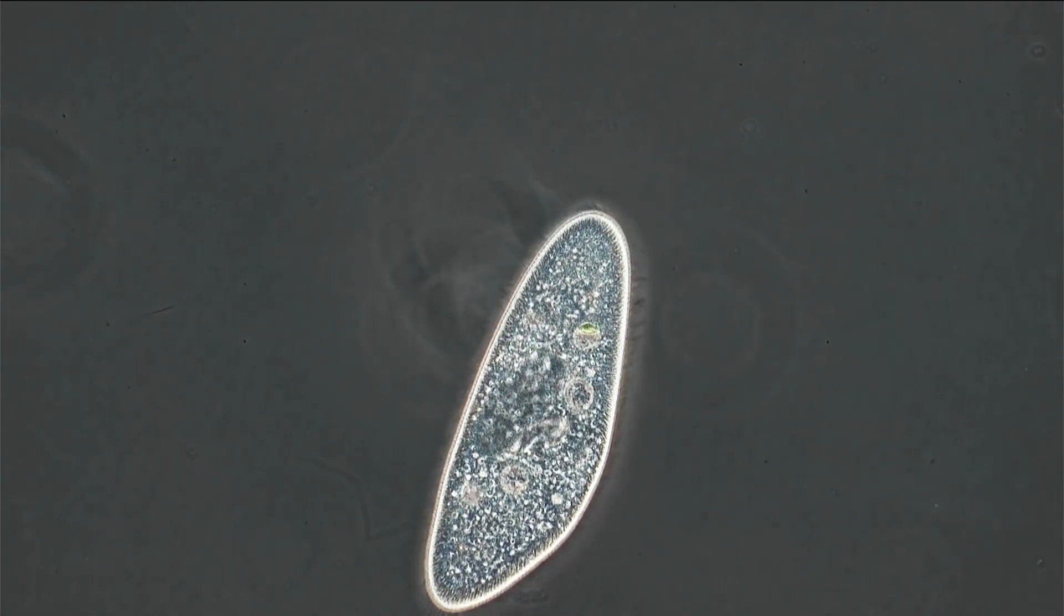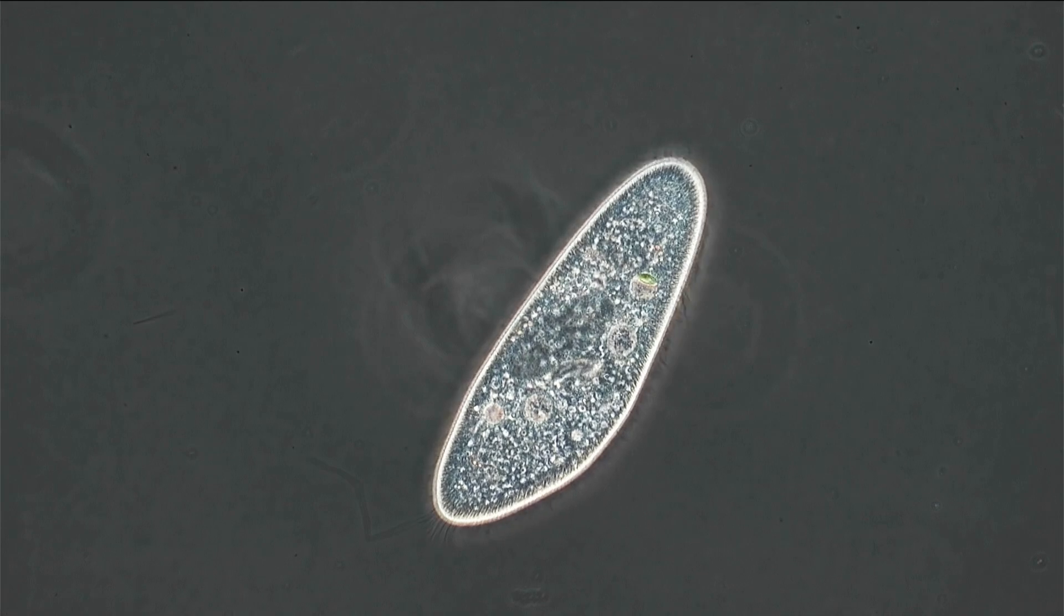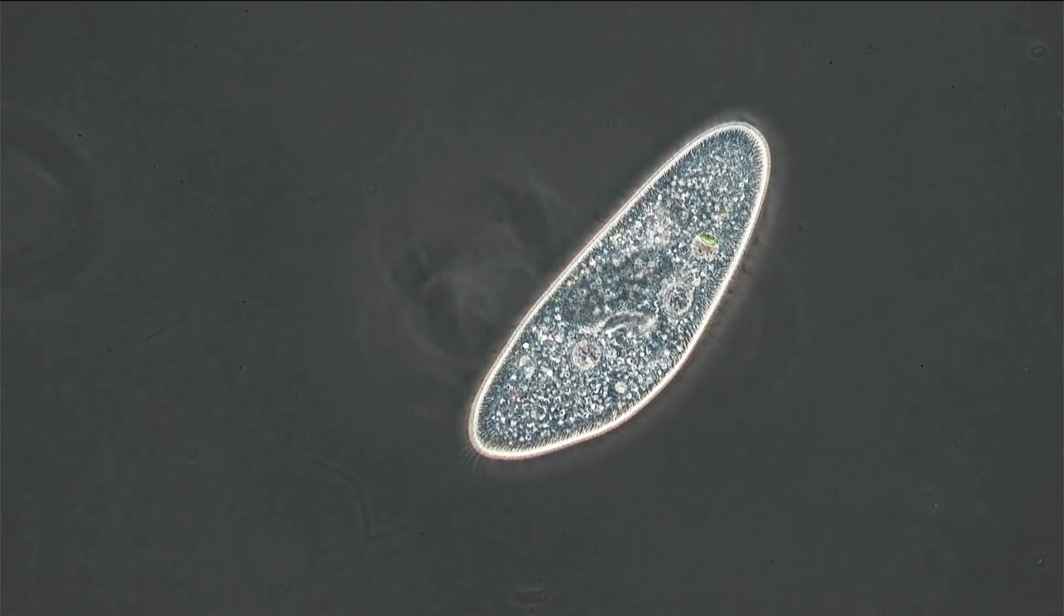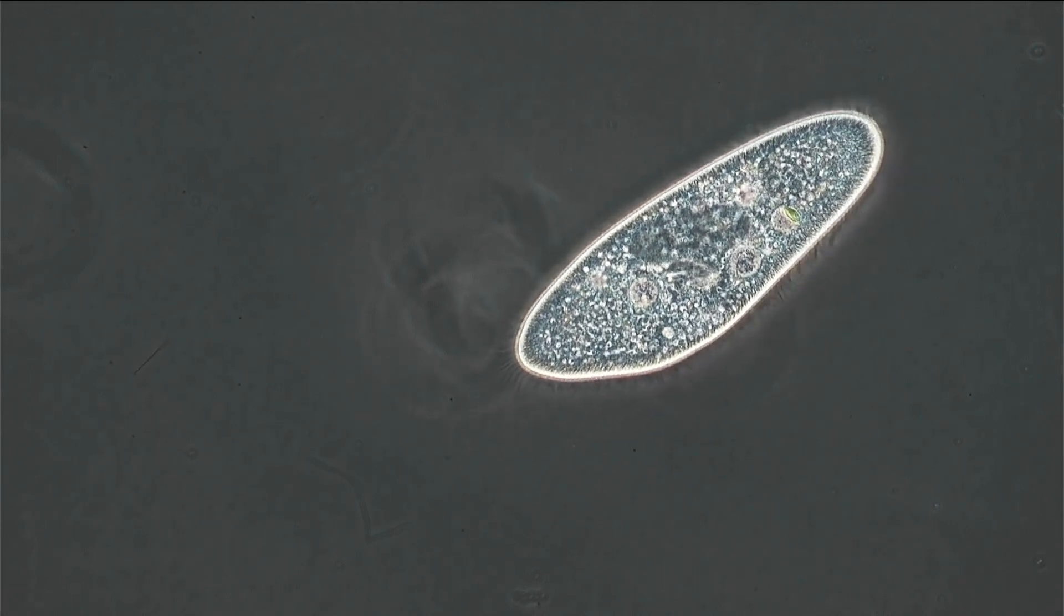So it's much more oval right now, of course, because if you squeeze something together, then of course it widens up and becomes wider. And this is actually also something that we're able to see here.